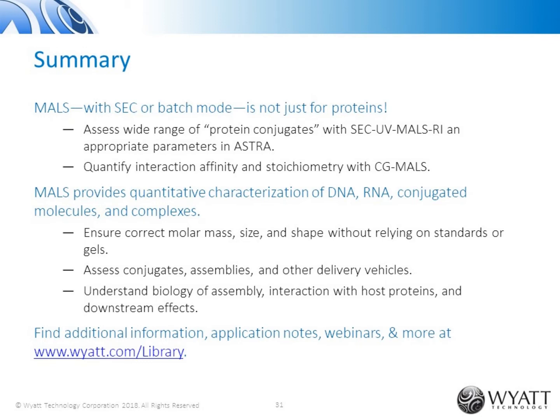Can we determine molecular weight or molar mass without knowing the sample concentration? The light scattering intensity is proportional to the molar mass times the concentration.